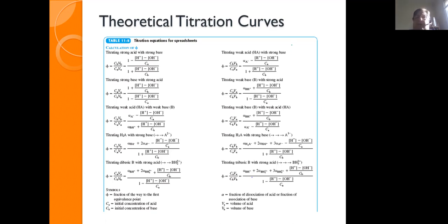Instead of doing something that looks like that for titration of sodium hydroxide with HCl, it just sort of gives you the first half and then it stops. But that's okay because you can still determine what the equivalence volume is, because remember, it's the volume scale that we care about, not the pH scale. So you can obviously tell that it's dropping dramatically. That's the volume for the equivalence point. So it really doesn't matter if it finishes it, you can still work with that data.